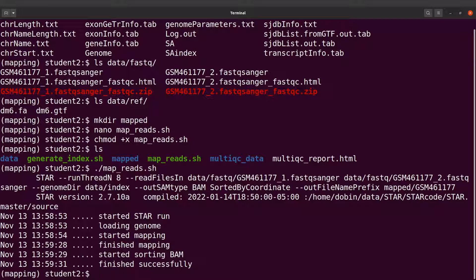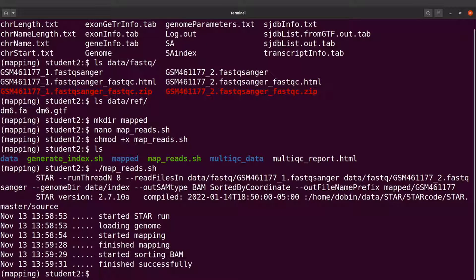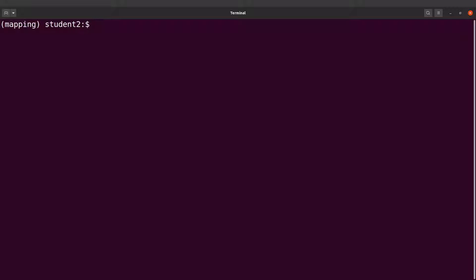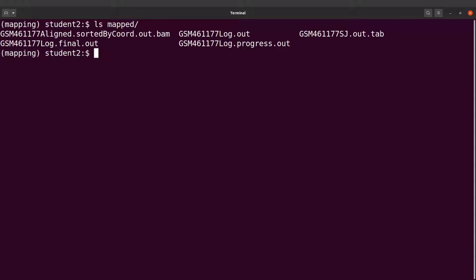Okay, general mapping has been done so let's take a look at the output files. Let's ls into the map directory, so we say ls mapped and we will see the output files.